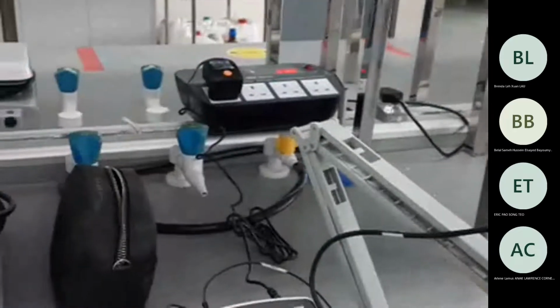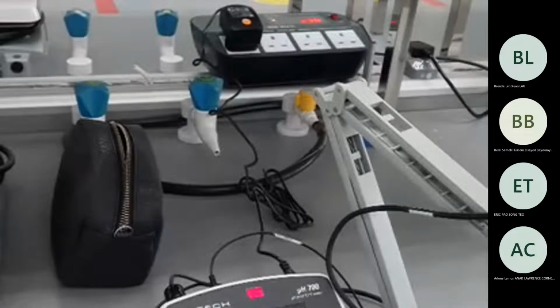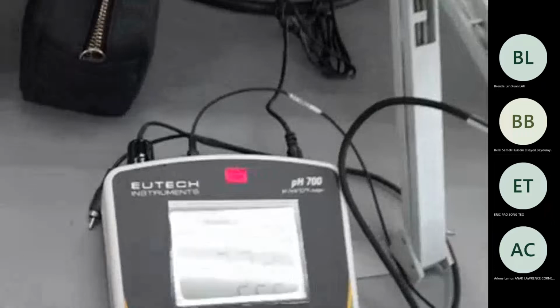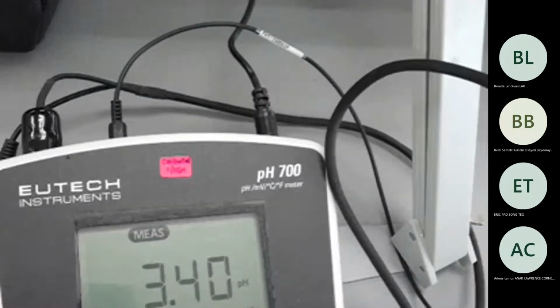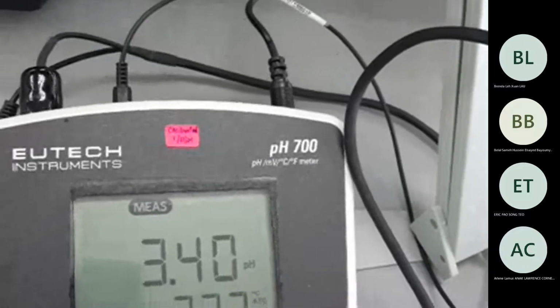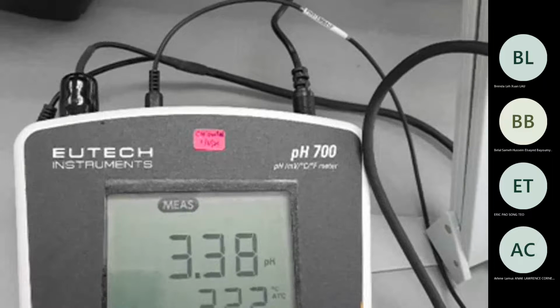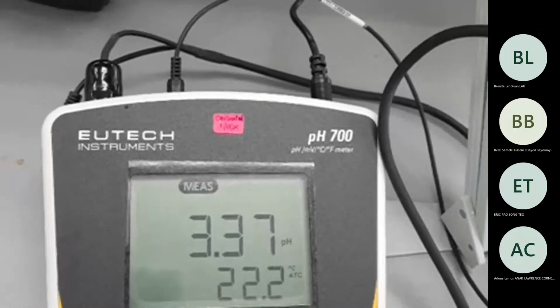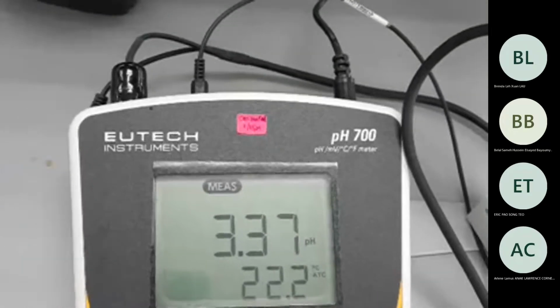And the pH is 3.4. It reduces, and it will reduce more because we have added HCl to it. 3.4, 3.38, but it is not reducing very drastically, so it's getting towards the stable value.